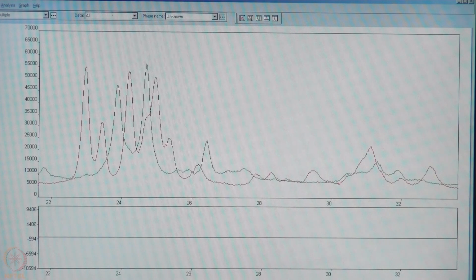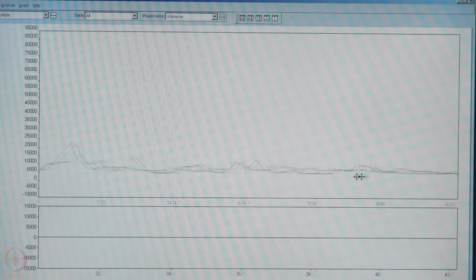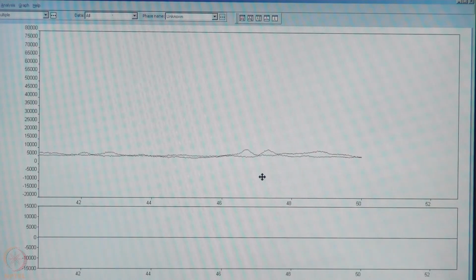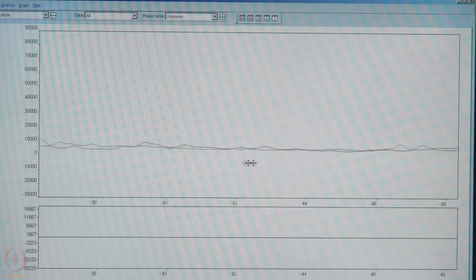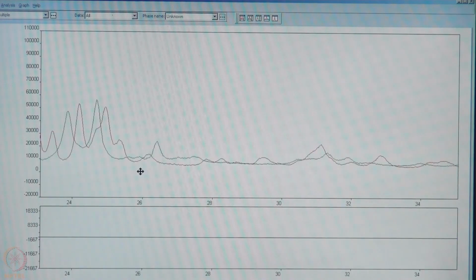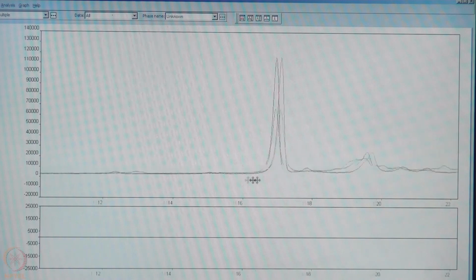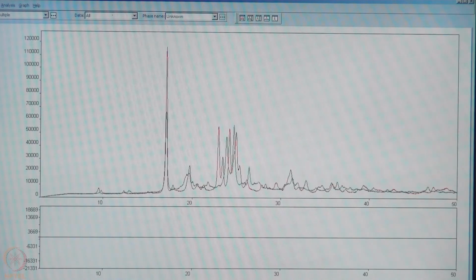This particular case, where the sample we know has originated from one particular compound and is giving two different crystal structures with two different sets of peaks appearing at two different points. So this is how one can identify polymorphs using powder X-ray diffraction data.